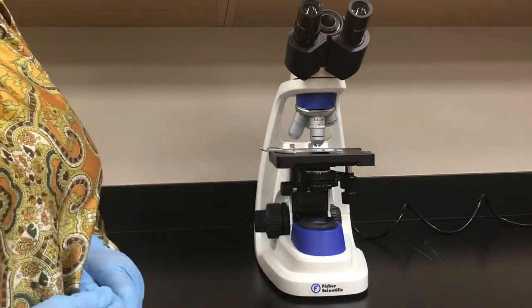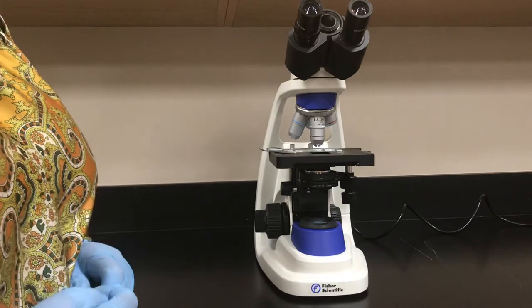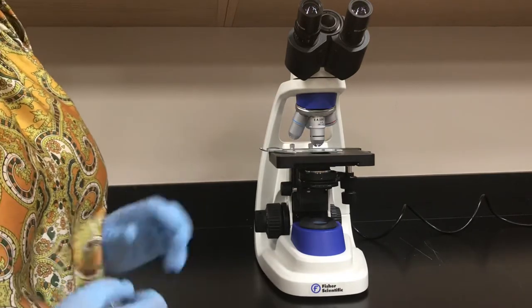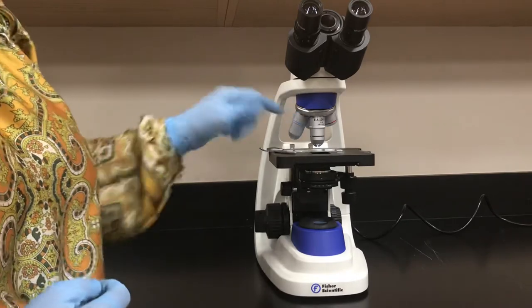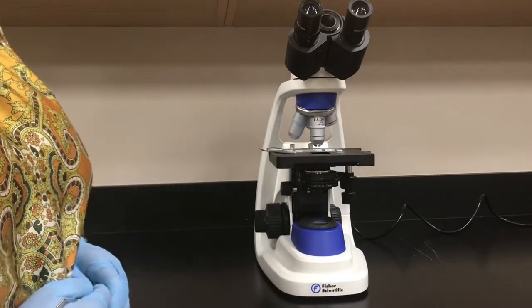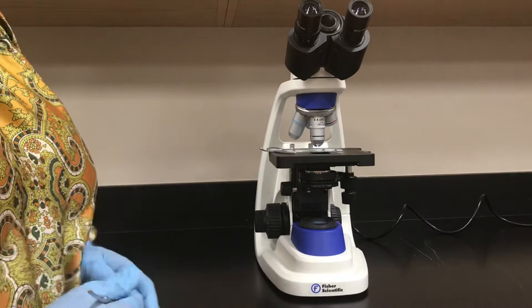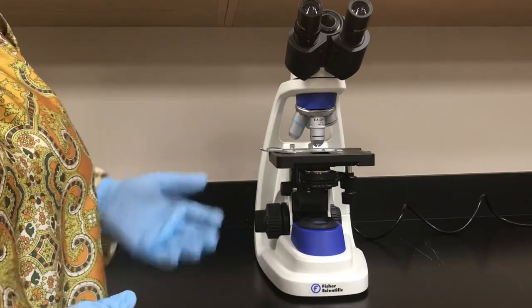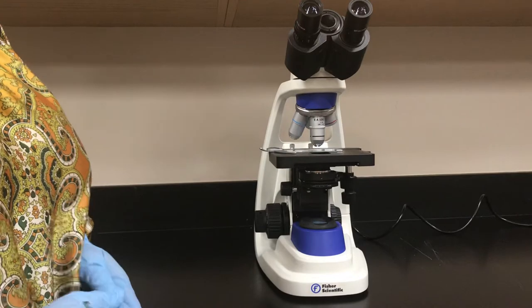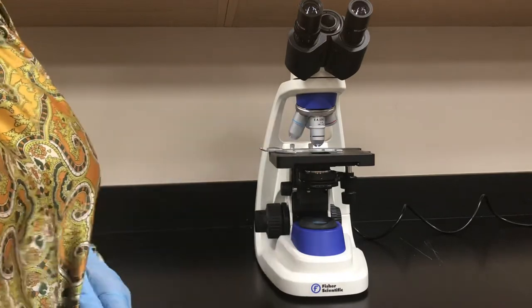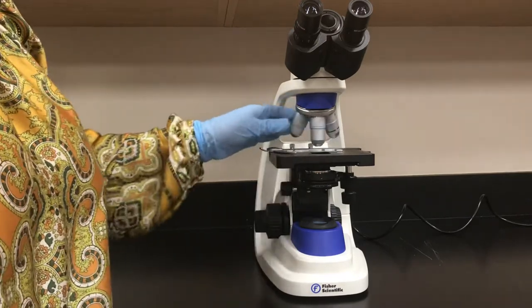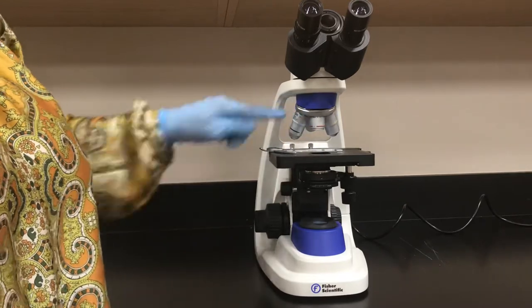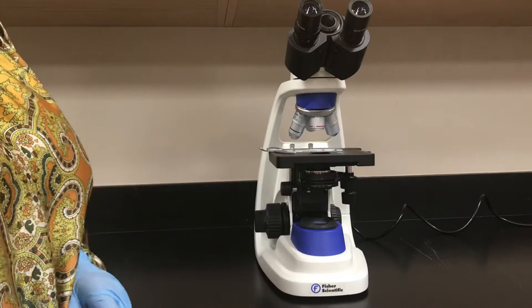The last objective I want to talk about is the oil immersion objective. It magnifies 100 times. It is sometimes blue, sometimes black, sometimes white color coded. You require a specific special oil and embed your lens into that oil to be able to see it. Look at how small the working distance is. That's why we always start and leave our microscope with the red color coded scanning objective.